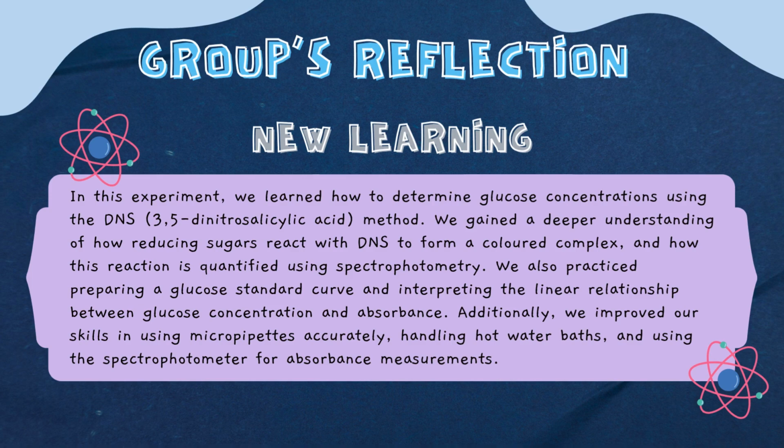We also practiced preparing a glucose standard curve and interpreting the linear relationship between glucose concentration and absorbance. Additionally, we improved our skill in using micropipettes accurately, handling the hot water bath, and using the spectrophotometer for absorbance measurements.